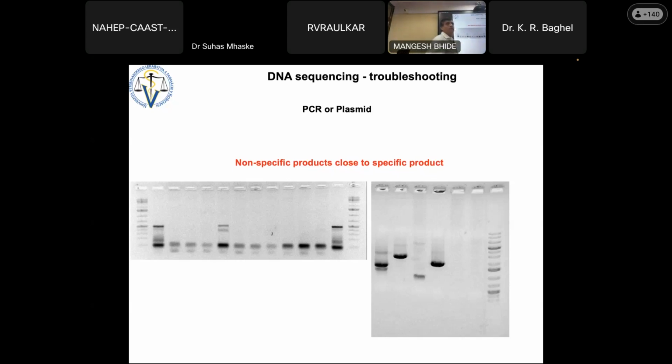Dimer. Yeah. So we need to cut that specific one, and that we have to set. Yes. Because always for comparison we require the labeling, means ladder, specific bands. Yes. So unfortunately, the company will not do it for you, because the company never knows what product you want. Okay, so you have to cut.